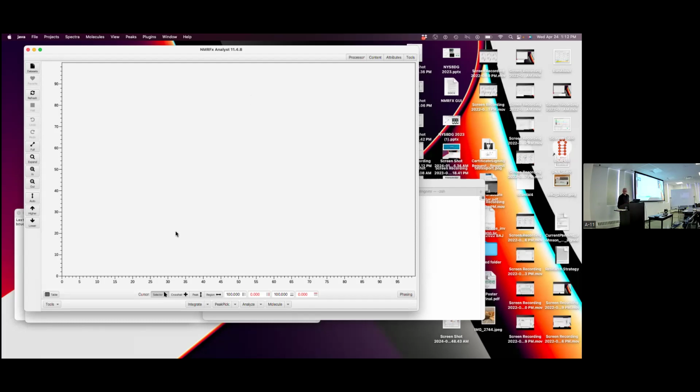Okay, so I'm going to start out really basic. We'll get more complicated, but I'm going to start simple. I don't know how many people out there are actually doing NMR, but we're going to start pretty simple, partly because then you'll see step by step how to use the software. We're going to walk you through taking just a single FID, simulated, and process that, and think about all the processing steps, and then we'll move on to more complicated experiments after that.